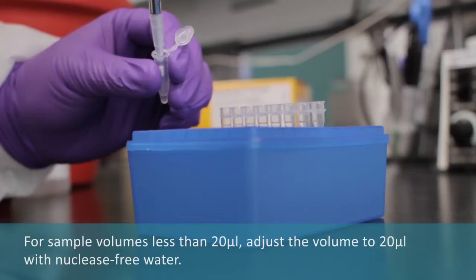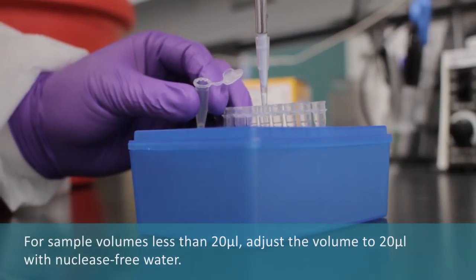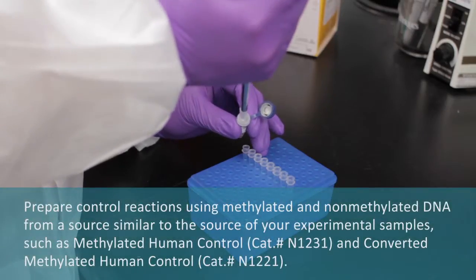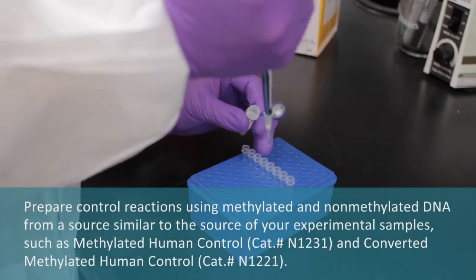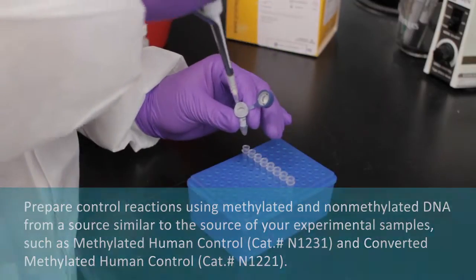For a sample volume less than 20 µl, adjust the volume to 20 µl with nuclease-free water. Prepare control reactions using methylated and non-methylated DNA from a source similar to the source of your experimental samples.